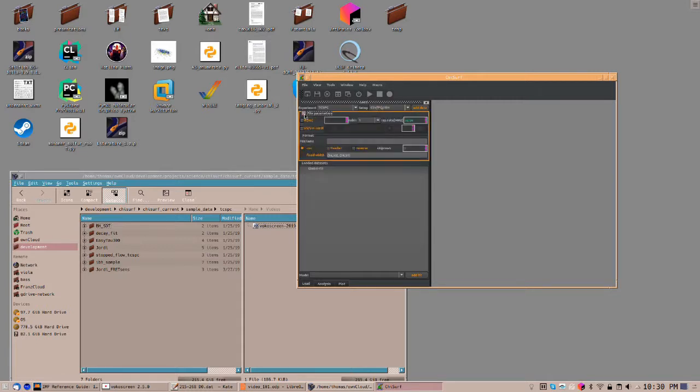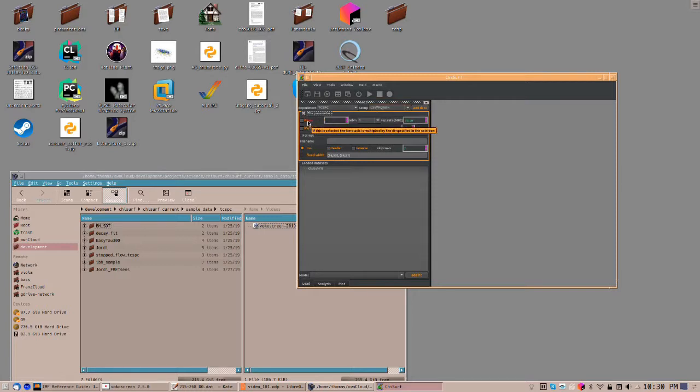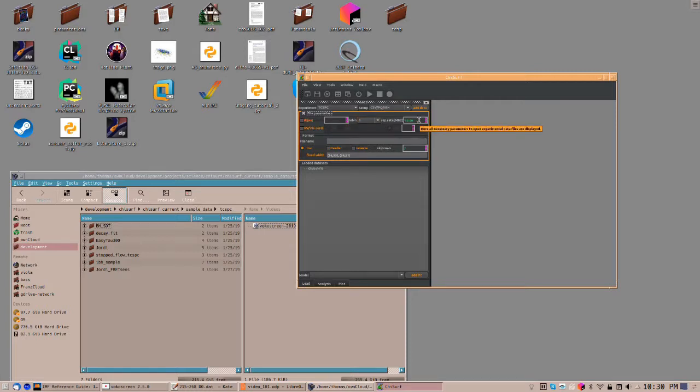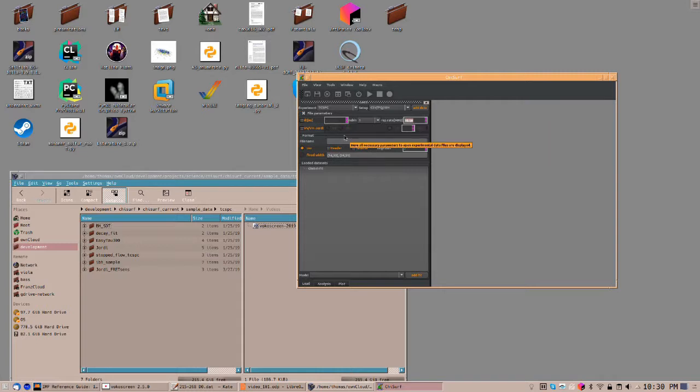When you want to see more options like the setup, click on File Parameters. You may have to specify the time resolution of your experiment, you may want to rebin your experiment, and you need to usually specify the repetition rate of the experiment.